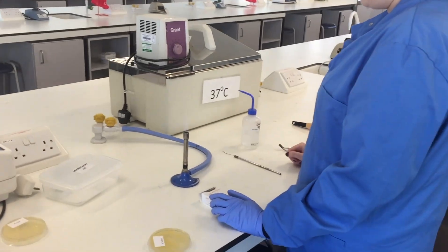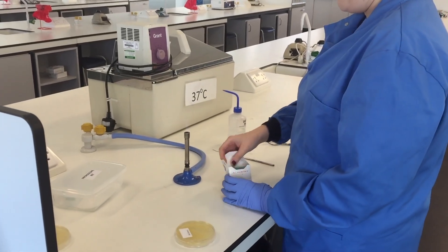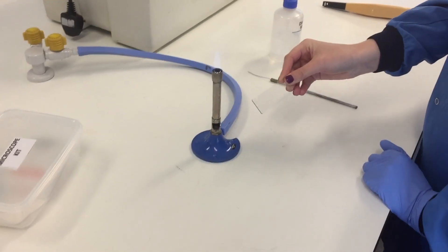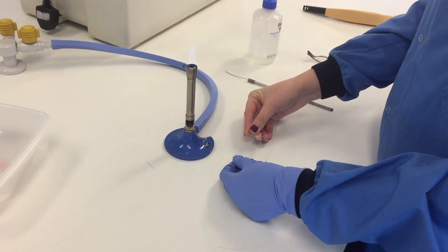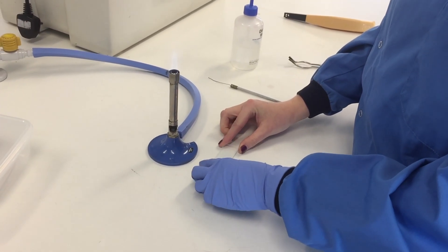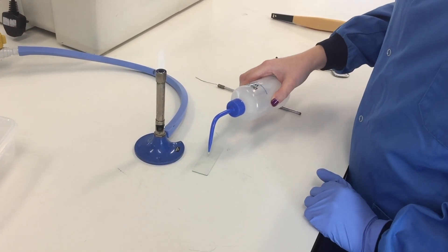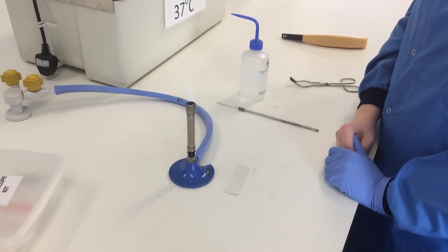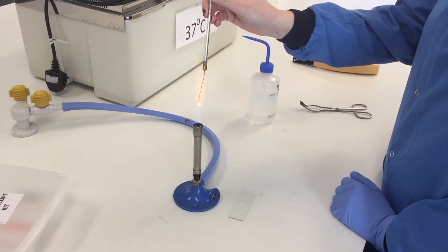She will get a single microscope slide from the box. Having acquired the single microscope slide, our demonstrator will now place a single drop of water, quite small, onto the slide. From this point, she will sterilize her inoculation loop using the center cone.